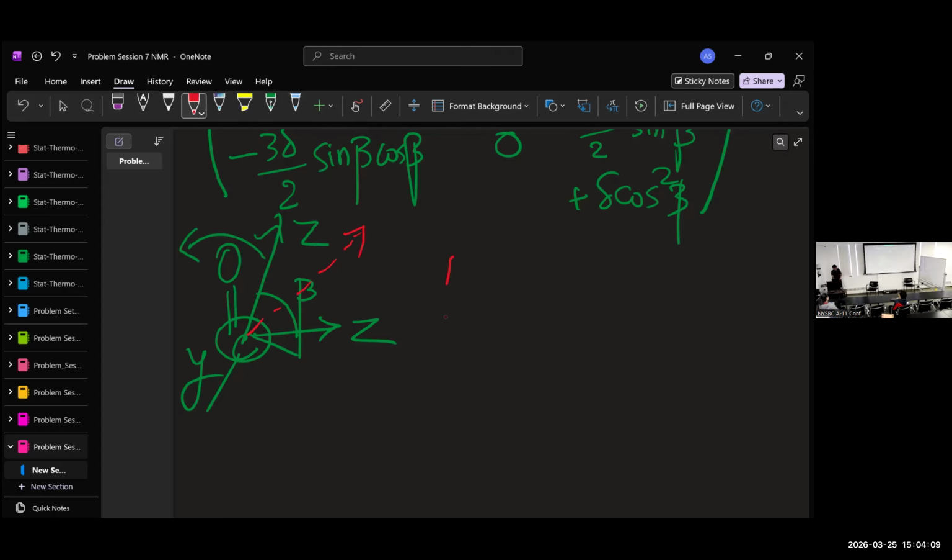Anisotropy. So the exchange rate is sufficiently greater than the tensor anisotropy. That becomes the condition for approaching the first limit, the mostly averaged chemical shift tensor. In this case, of course, for every crystallite, and by crystallite we mean for every Euler angle for the molecule fixed frame, you can calculate what that fluctuation, what this orientation and that orientation will look like. That's going to change for every molecule fixed frame. And then you arrive at this.